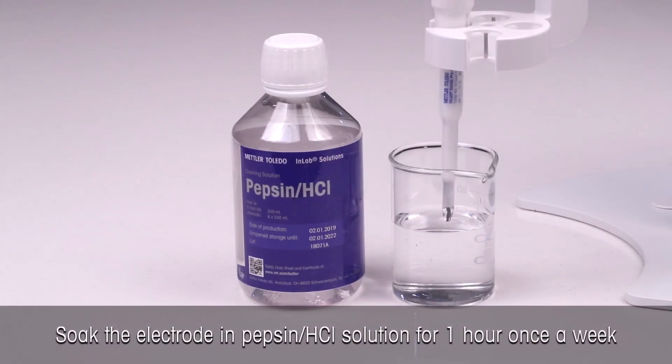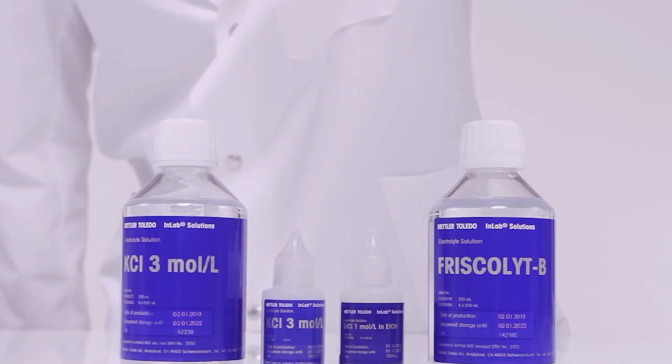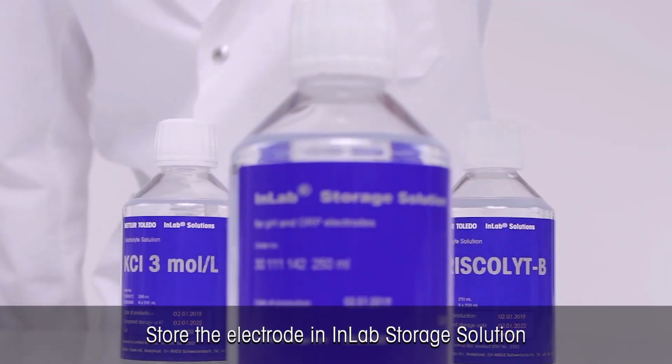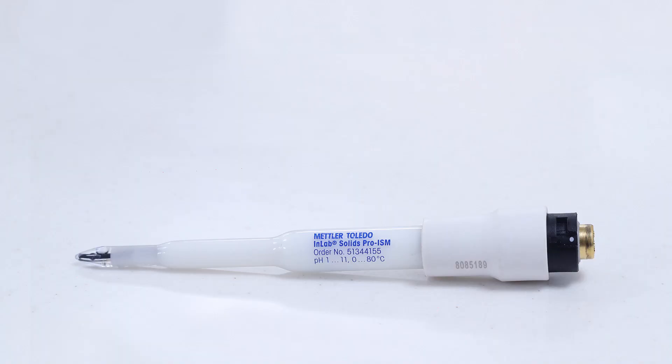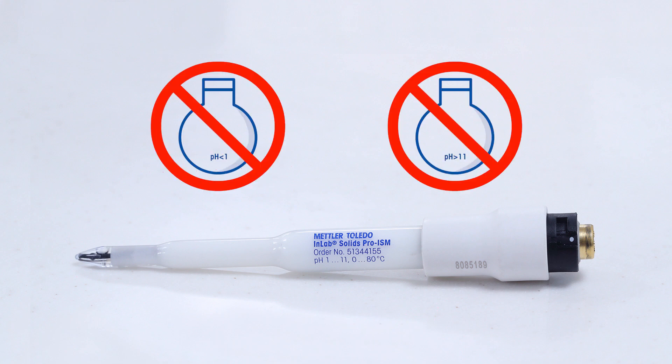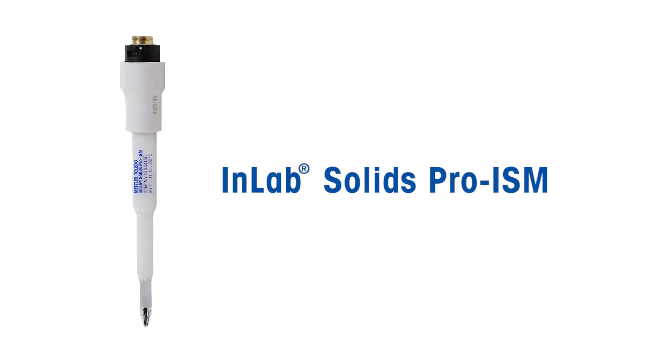It is also recommended to soak the electrode in pepsin HCl solution for one hour once a week to remove protein buildup on the glass membrane. Store the electrode in In-Lab storage solution when not in use. The pH range for In-Lab Solids Pro ISM is 1 to 11 pH units, and hence it should not be exposed to harsh acidic or alkaline chemicals. Make the right choice of electrode for your application to achieve higher accuracy.